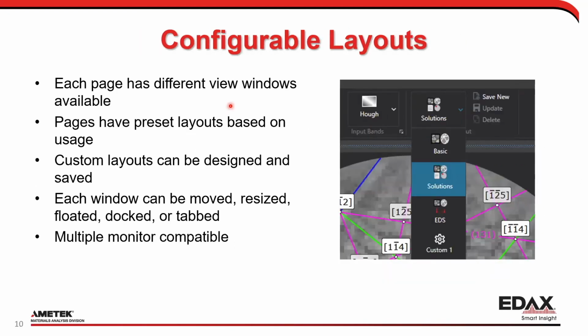All the layouts in Apex are user configurable, so these windows can be popped out. Again, I'm spoiled a little bit. I have a 49-inch curved monitor down the hall, so I can drag and move things around between the two monitors, because basically it's two monitors in one in a very large layout. So I can pop out my imaging window all by itself if I wanted to. Or again, I can go ahead and put these in a tab structure. I can put these side by side. But in general, we have these pre-made layouts.